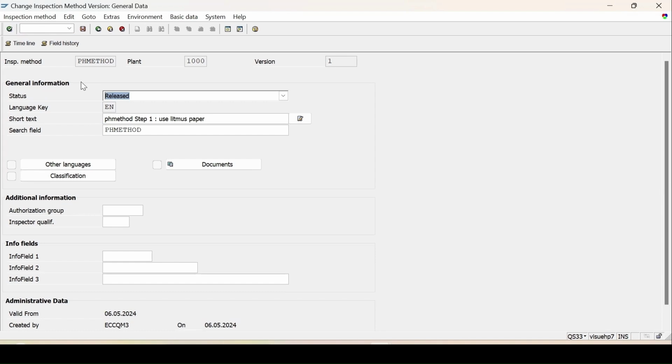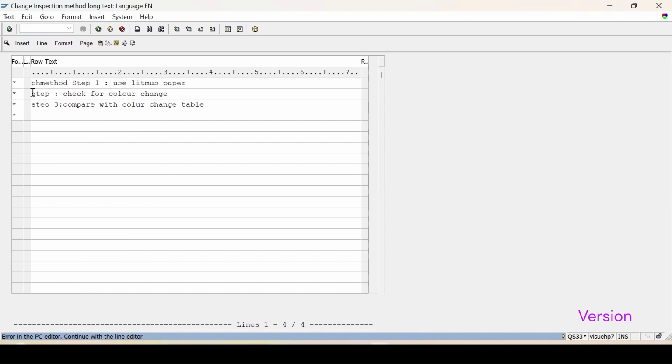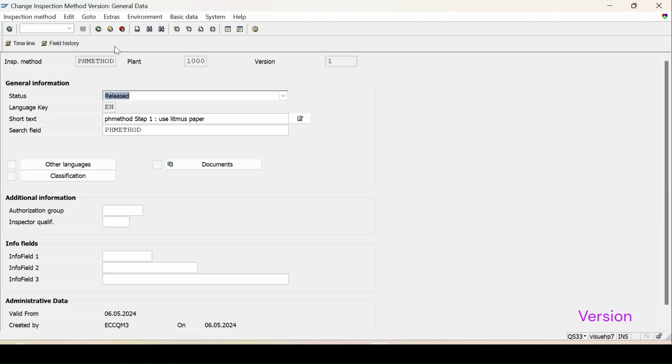Suppose they are following some guidelines which we have specified here, and now rules and regulations have been changed and they are saying add one more guideline to be added when we are doing the inspection for this thing. You want to maintain the previous one also as it is, plus one extra precaution you want to add in that. The main thing will remain the same, only a slight change is done, right? Standard steps will remain the same, only how to test the pH of any material, but extra guideline I want to add. Then I will create a version for it.